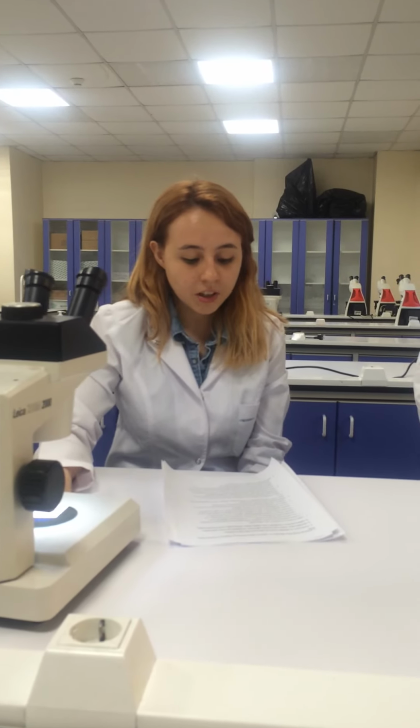The second step is the differentiation process of adipocytes. It should be noted that after seeding porcine adipose-derived stem cells on 6-well plates, they will be confluent within 72 hours. After 3 days, the medium is removed, and then 3 milliliters of adipose induction medium is added into each well. The plates are returned to the incubator. This is day 0 of differentiation.